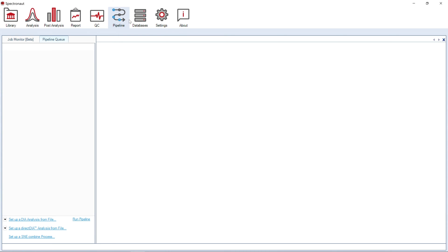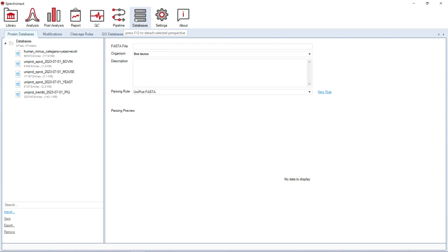The Database Perspective contains all resources needed for data analysis, like FASTA files or modification database.